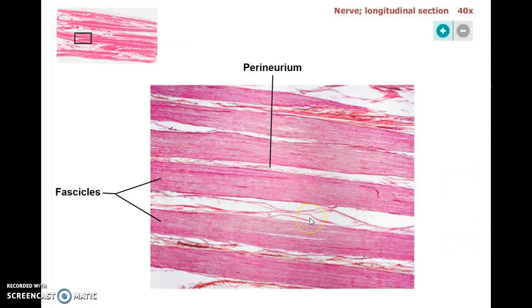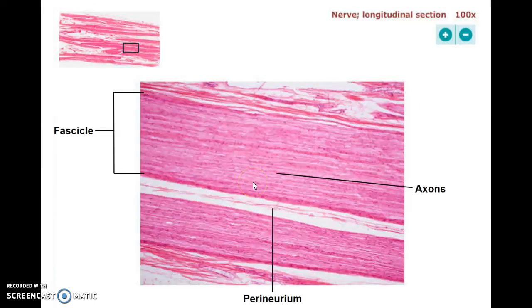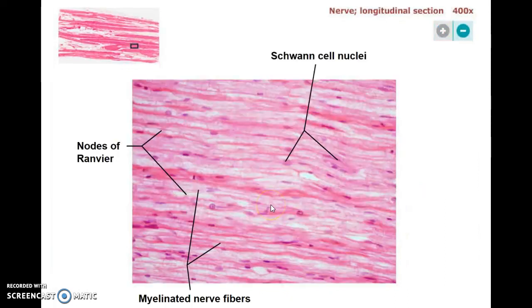This is now a nerve — a bundle of neurons in longitudinal section — showing some of that perineurium tissue. The fascicles are bundles of neurons, seeing them up a little bit closer. When I say bundles of neurons, I really mean bundles of axons. These are all the axons running along here with the fascicle surrounded by the perineurium.